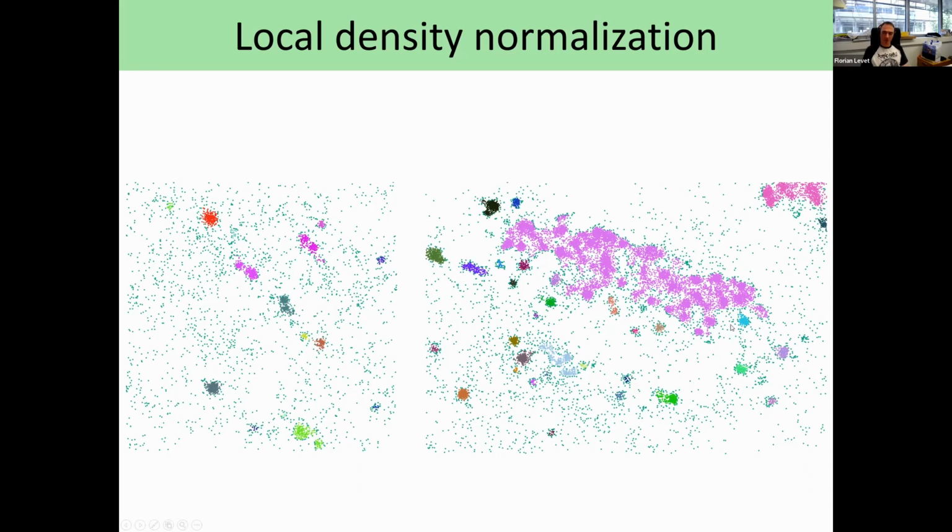That's true, but the difference is that we can use exactly the same techniques that we showed here inside the adhesion site. So we can choose the localizations that have twice the average density of the adhesion site here in order to find this selection of clusters inside the adhesion site and create the objects, the clusters.